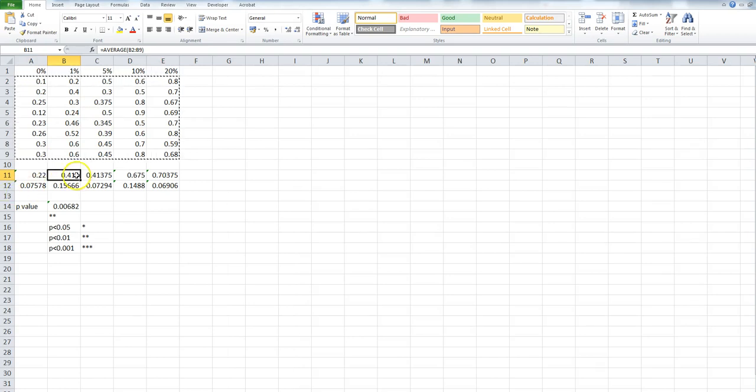As you can see, that is roughly double that. There's also an overlap of the standard deviations, which we'll come to in a moment, but we've got more certainty that that is higher than that. Some degree of certainty that that is higher than that, but more so here. And that will make sense when you see the graphs.